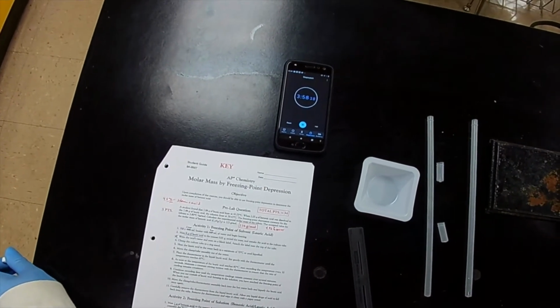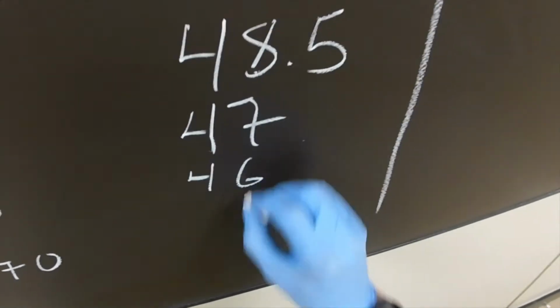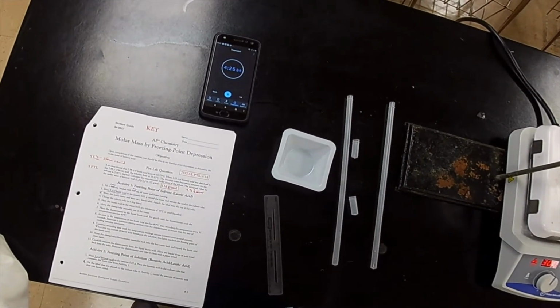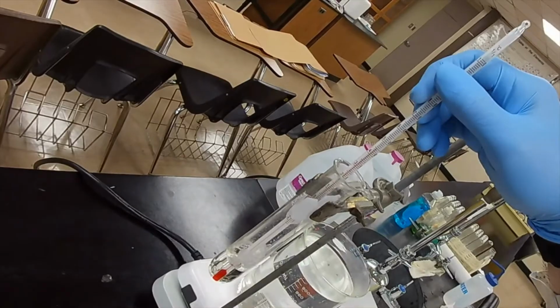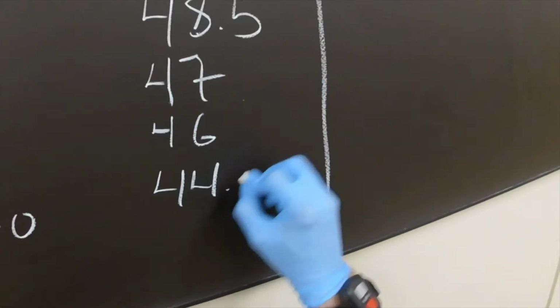Coming up on another measurement right now. 46. We're getting close. Very close. Okay. Take a look at those numbers. Ready for another measurement soon. 10 seconds. And it's 44.5. I don't see any crystals yet. 44.5.